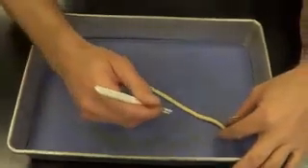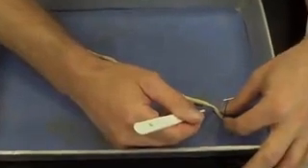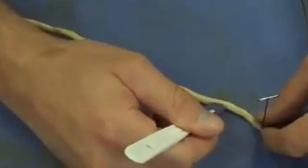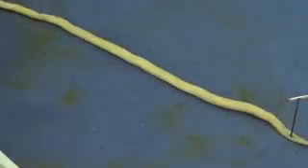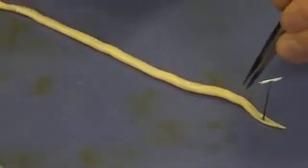Always cut away from your fingers. I'm going to start near the anterior end and make a small incision, cutting about an inch. At that point I'm going to grab my forceps and a pin, and begin reflecting the skin back.